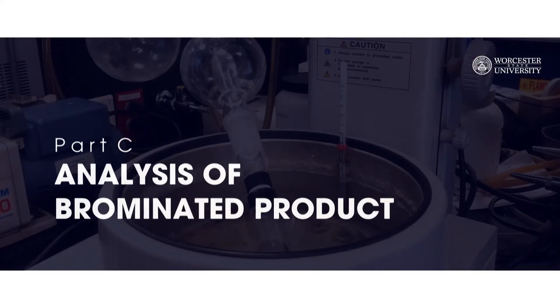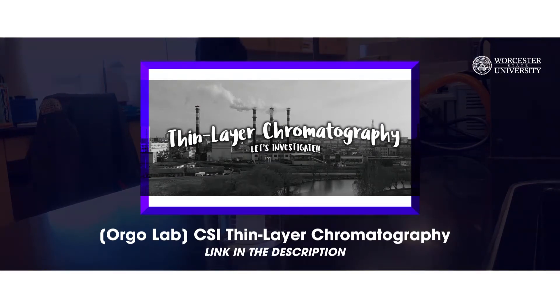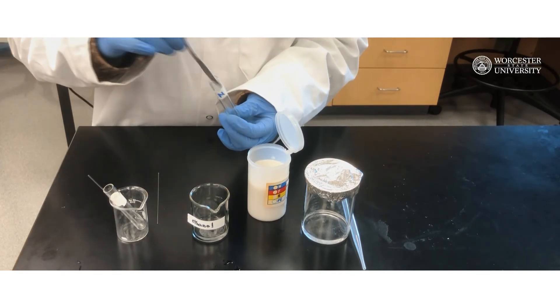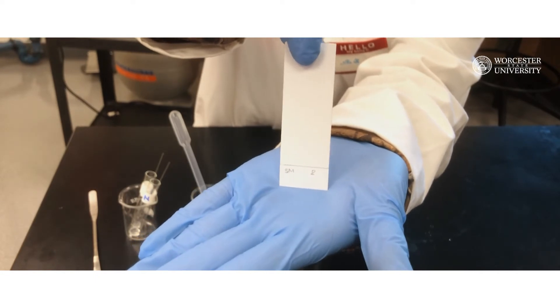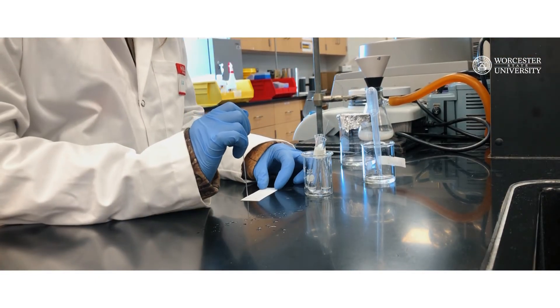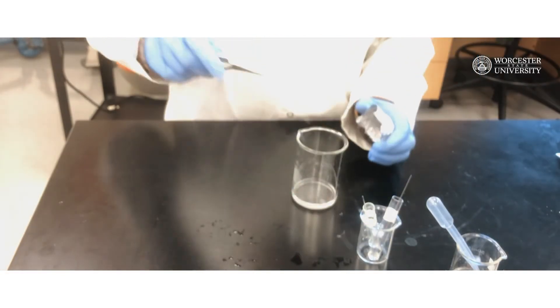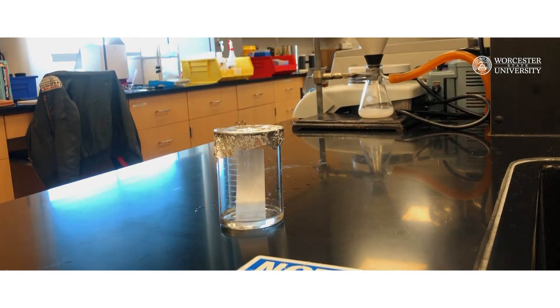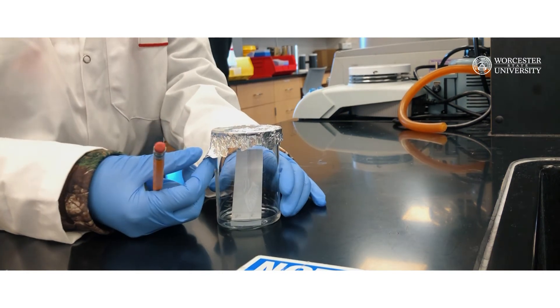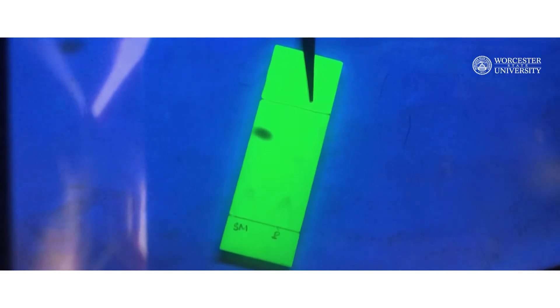Part C: Analysis of brominated product. You will use TLC to analyze the product. You may want to check this video here for a more detailed look at this technique. Dissolve a tiny bit of the starting material and product — only the tip of a small spatula — in about 1 milliliter of ethanol in two separate labeled test tubes. Spot your samples on a TLC plate. Then transfer your eluent — in this case 10 milliliters of 19 to 1 hexane to ethyl acetate — to a dry beaker. Place your spotted TLC plate inside the beaker using tweezers and cover the beaker with aluminum foil. Once the plate develops, visualize it under UV light. Sketch the plate in your lab notebook and calculate the Rf values. Always record and report Rf values with the solvent used for developing the TLC plate.